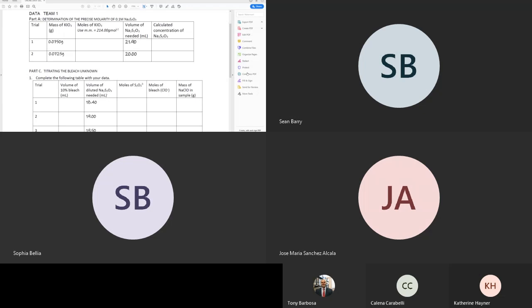Sources of error, yeah. Think about where the sources of error are. Obviously it's in measurements. What types of measurements? Is it devices and things?